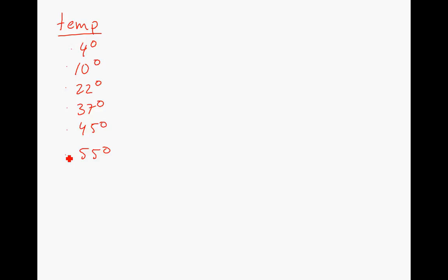We'll get these baths set up, right? And we'll go from there. We'll see if that's going to be good enough. Because we had lots of groups trying to set this up, and everybody at different temperatures, getting these water baths, especially these warmer ones here, set up early enough and long enough so that the water gets up to that temperature is sometimes a little bit tricky. So let's standardize the temperature there for all those groups. Okay, and I think we'll just go with that, and I think that's it. So if there are questions or confusions, let me know.